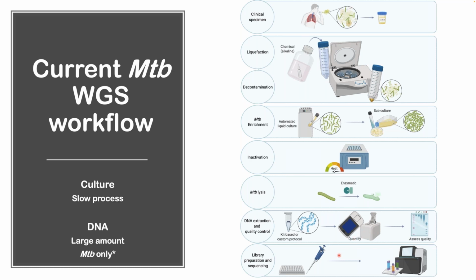And then finally, the DNA is prepared into sequencing libraries and subjected to next generation sequencing on platforms such as Illumina sequencers, which are really widely used for MTB whole genome sequencing.